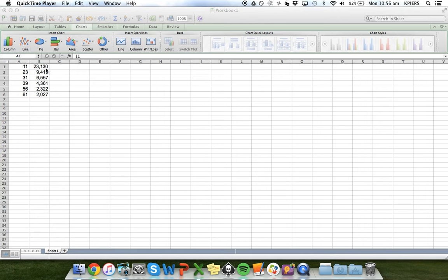nucleotide band, so the DNA piece that's 23,000 bases long, ran only 11 millimeters in the gel, whereas the 2300 size fragment ran 56 millimeters, and so on. So what I want to do is actually plot this now.